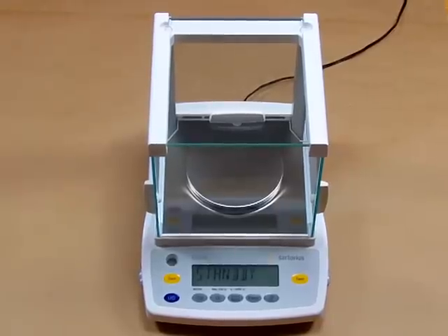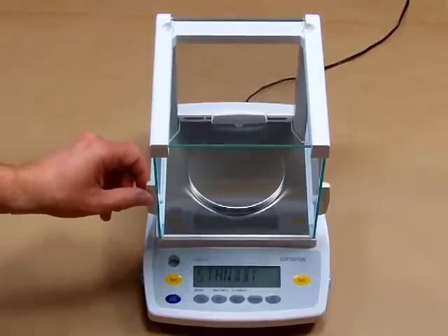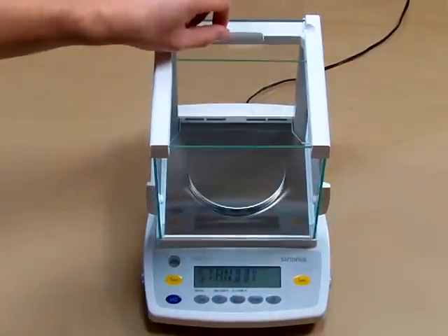This milligram balance offers a three-door glass draft shield. You can open the balance from either side for easy access, or you can open it from the top.